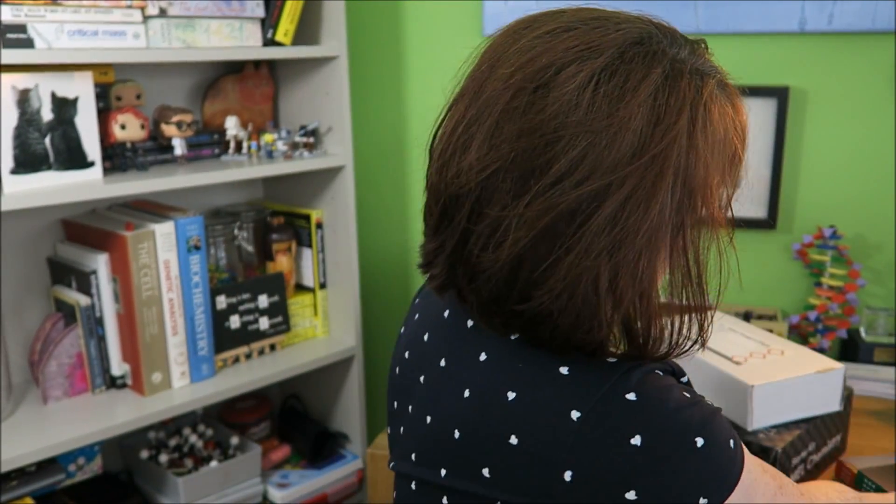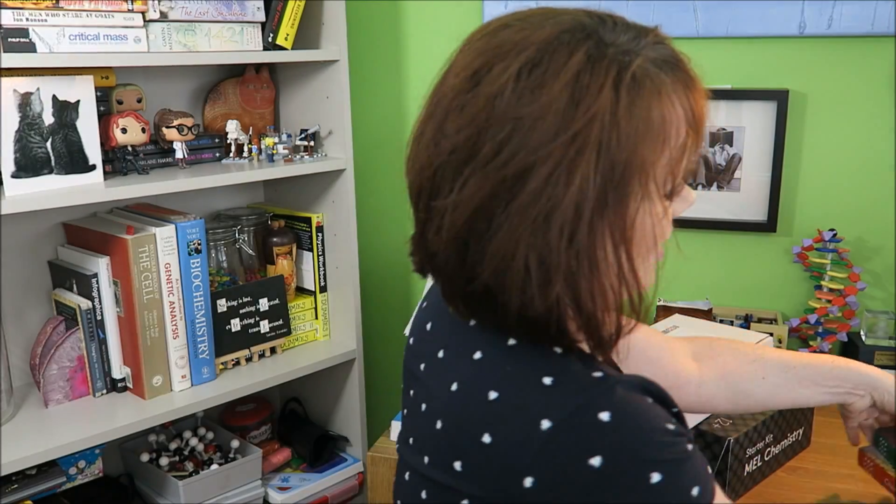You give me loads of chemicals and I wonder what would happen if we just put that in there, and then — ooh, look at that. So Mel Science have sent me a chemistry kit; they're not paying me for this, they've sent it to me. So they sent me the starter kit, which is these big boxes here. We'll have a look at what's inside in a second, because I've had a quick look and it does look really good. And two experiments to do.